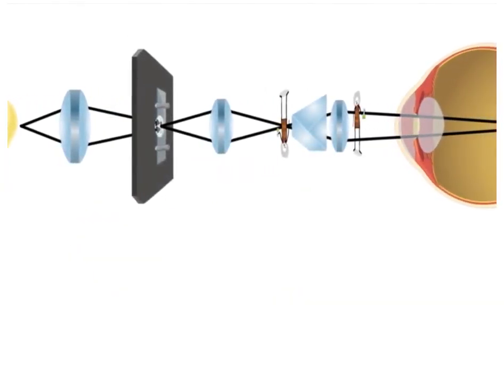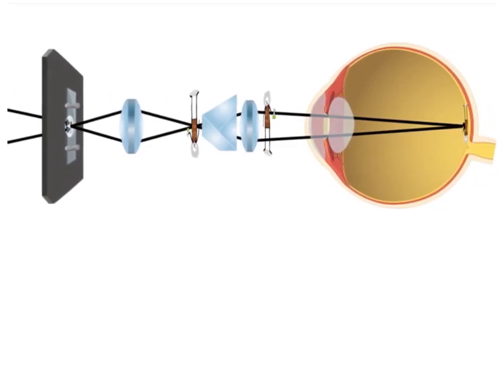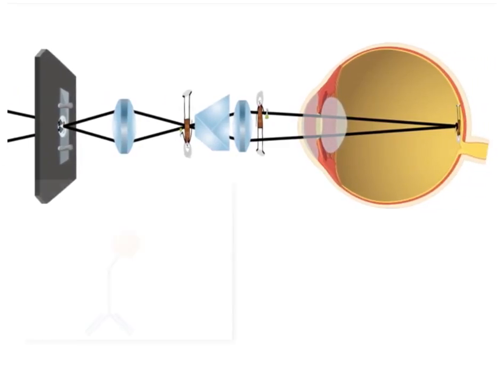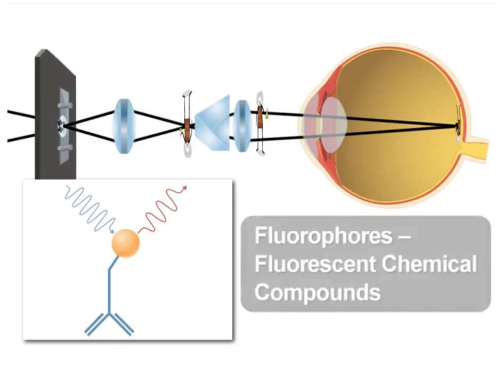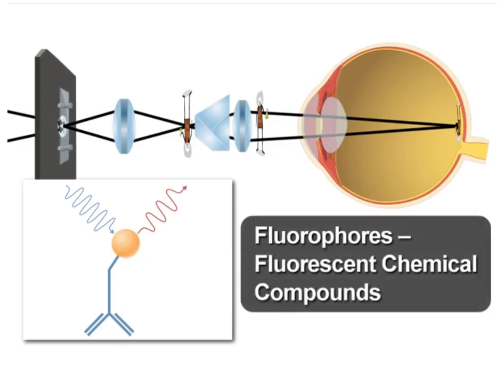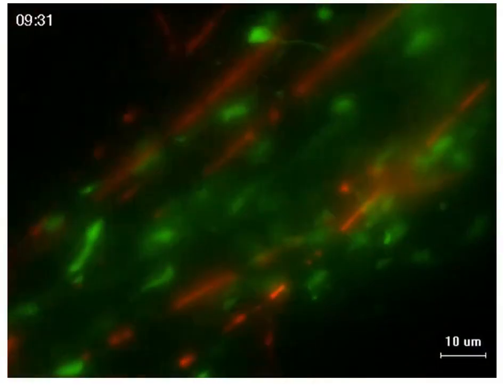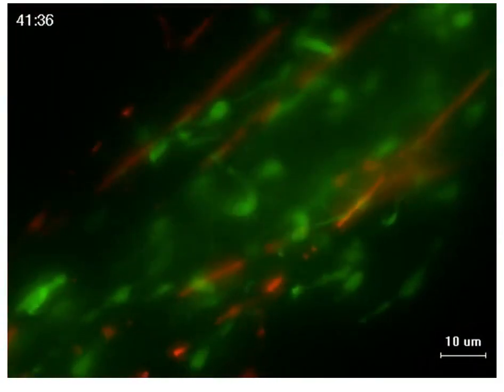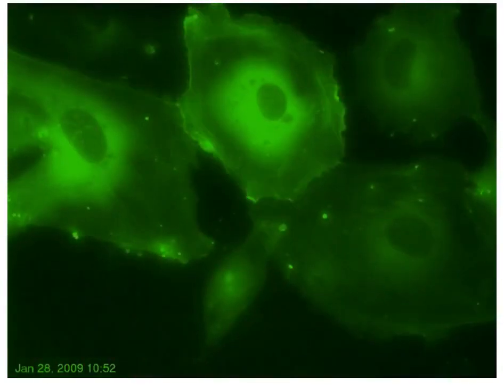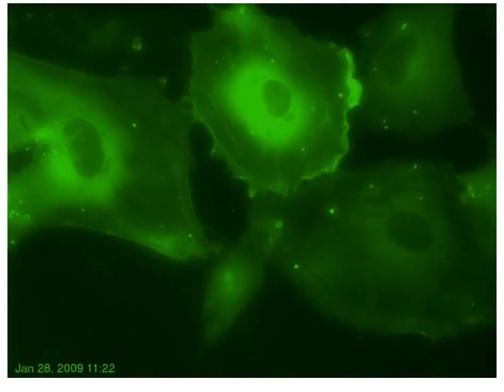Fluorescence microscopy combines the magnifying properties of the light microscope with fluorescence technology that allows the excitation of and detection of emissions from fluorophores, fluorescent chemical compounds. With fluorescence microscopy, scientists can observe the location of specific cell types within tissues or molecules within cells.